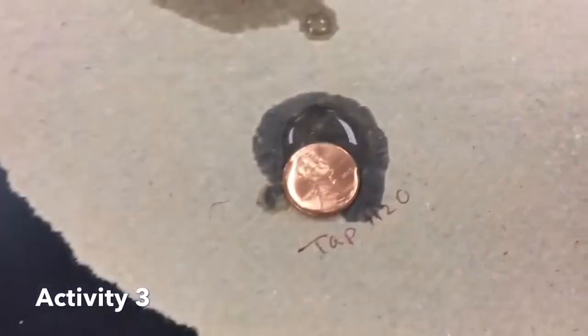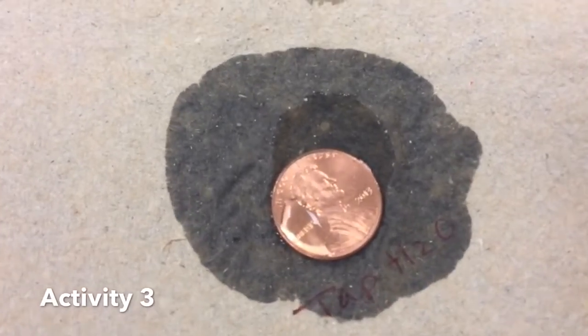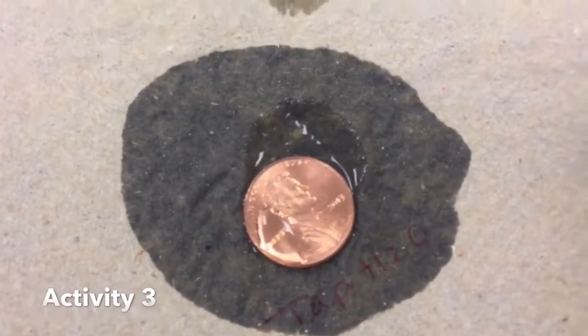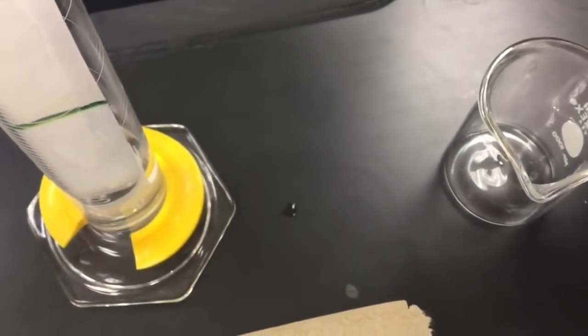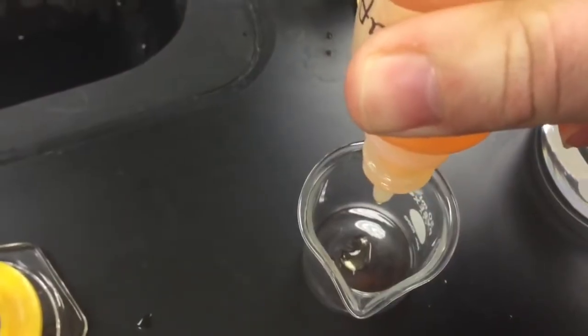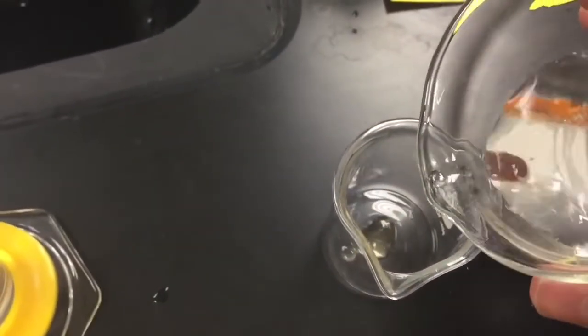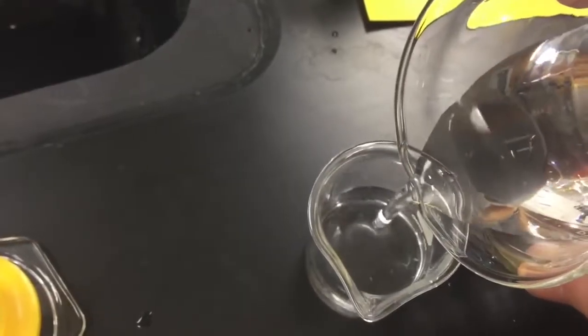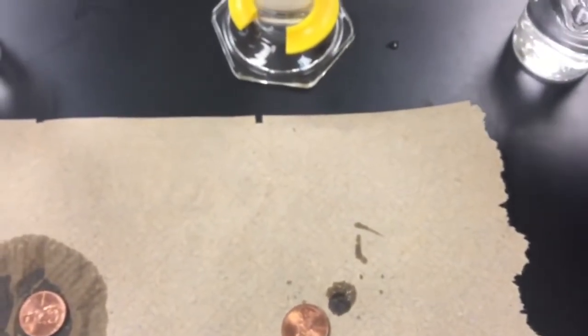Next we're going to do the soapy penny. We have regular dish soap like Dawn - we're going to put a few drops in the bottom of a 50 milliliter beaker, then add some tap water to make our soapy solution. Water is the solvent and the dish soap is the solute. We're going to use a different eye dropper so we do not cross contaminate - this one has only been used in regular water.